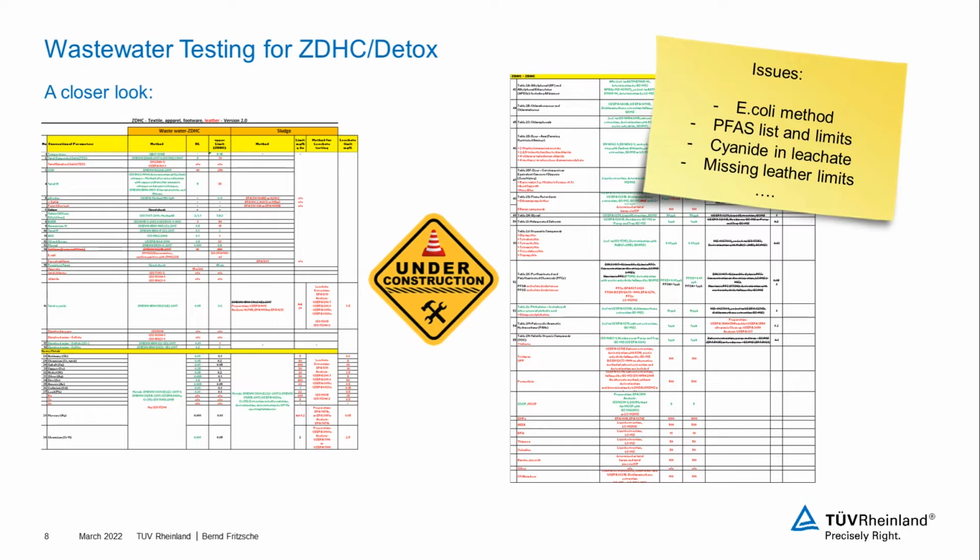Now we just saw the high-level changes. When we take a closer look, like here, you will see that almost no stone has been left unturned, and everything that is red here has been a change. So most of the parameters have gone through some change, either with the required limit, the test method, or the scope of parameters.